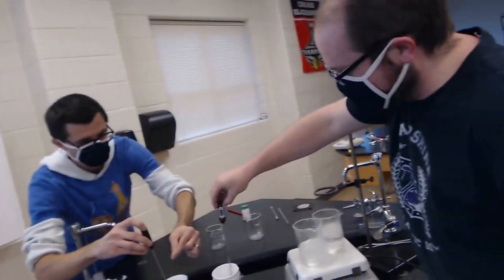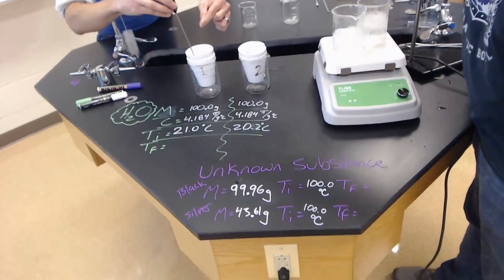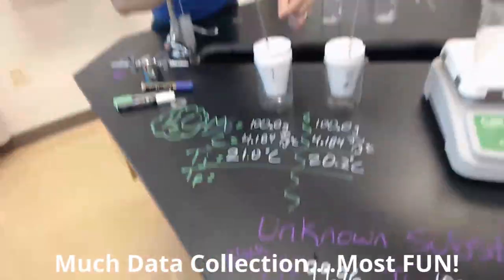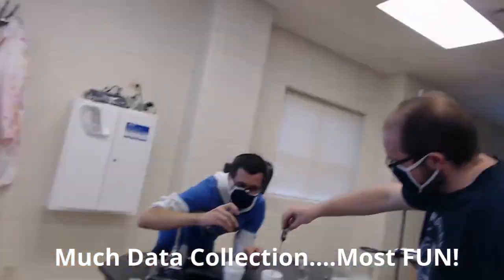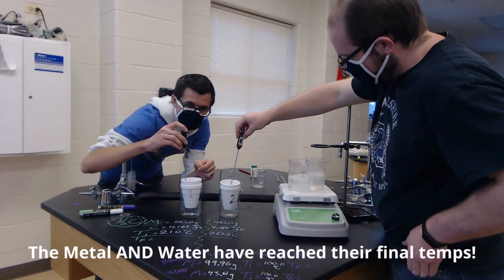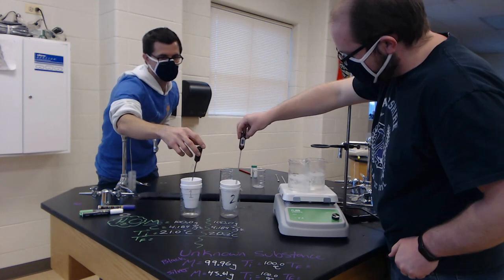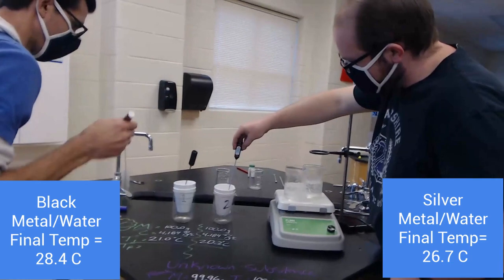The metal temperature is decreasing while the water temperature is increasing, until they reach equilibrium. I think it's pretty stable now — I'm gonna write that down, Mr. C, and then we can get our last reading here.